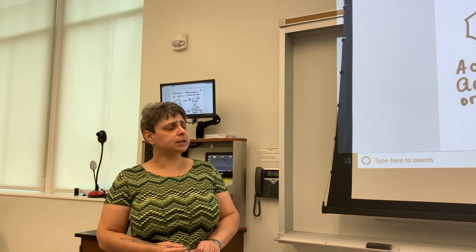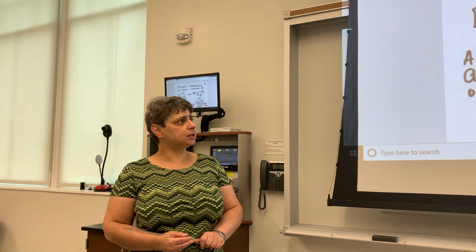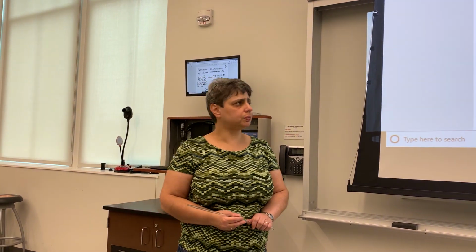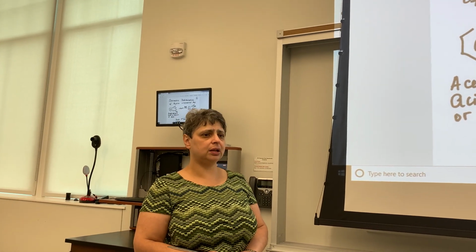If you recall, we discussed Beer's law briefly in Chem 1240, and now it's time to delve into a little bit more depth as far as Beer's law and define some additional parameters within it, and also discuss how it's going to be used in experimental chemistry. Because Beer's law is so important and such a widely used relationship in general and analytical chemistry, you're likely to encounter it again in both chemistry and biology.